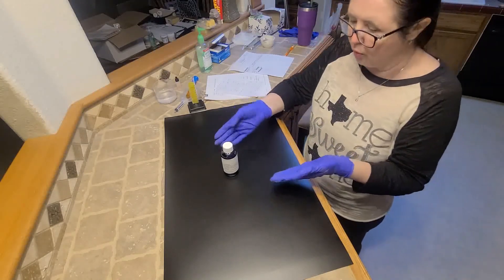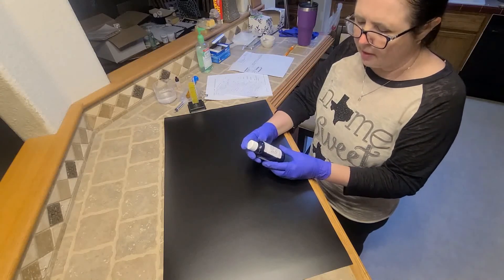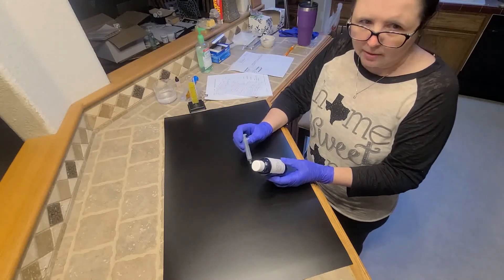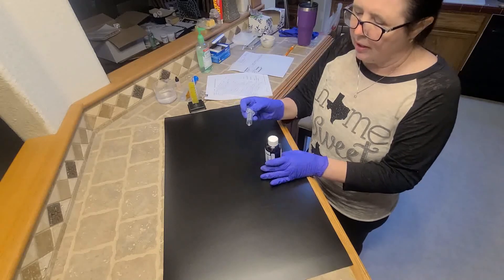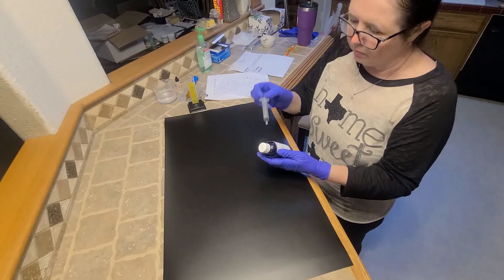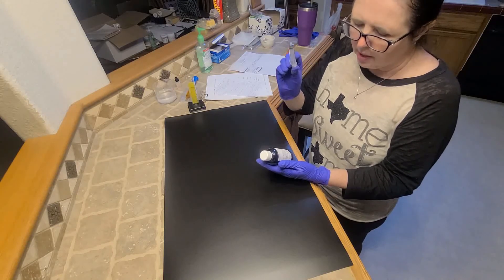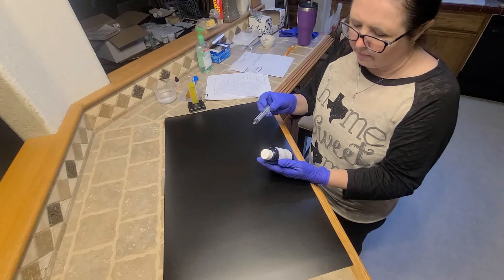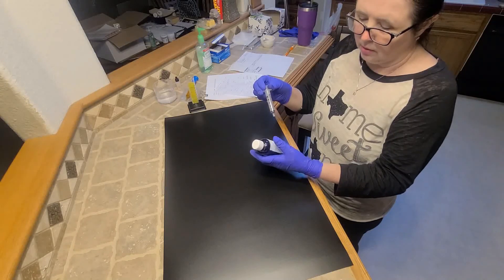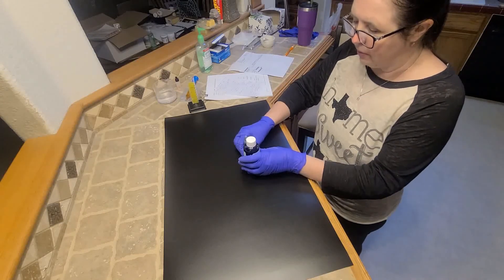I'm going to be dispensing this to the patient's mother or father, and I'm going to explain to them that the first dose they will give will be today, and it will be 10 milliliters. I am providing them with a 5 milliliter syringe, so they will have to do this twice today. Then for the next four days, they are going to give 3.75 milliliters. This medication will be discarded after that, and any remaining ingredients will be thrown out.